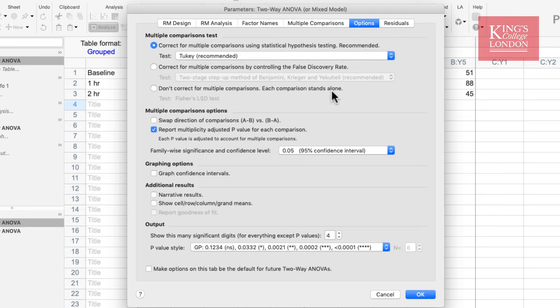Beyond the multiple comparisons window are your narrative results, which give you the answer you're looking for in plain English. For instance, does genotype have the same effect on all values of time? Because we entered the words 'genotype' and 'time' into our column and row names, it gives us the answer in plain English. Of course, these observations are just the results of the mathematical statistical test, and you will need to determine whether the results are relevant to your model based on your hypothesis. So that's how you carry out a two-way ANOVA with multiple comparisons. Prism guides you through the process and at the end will produce a narrative page which will help you decide the outcome of your experiment.